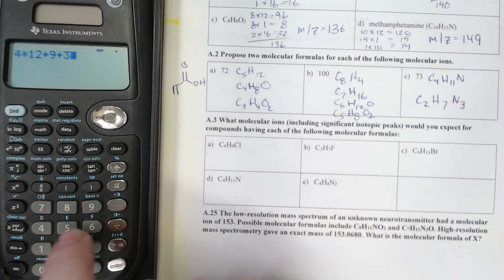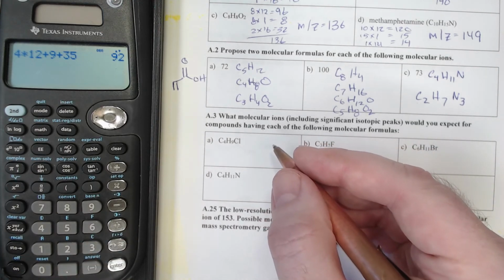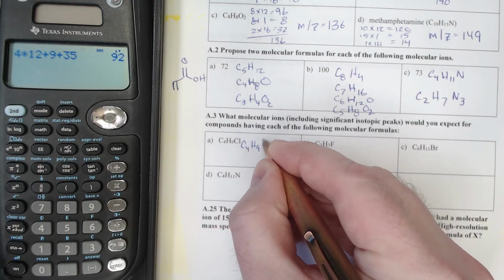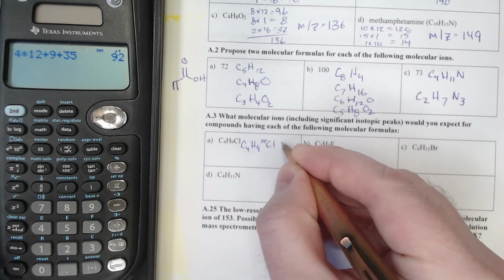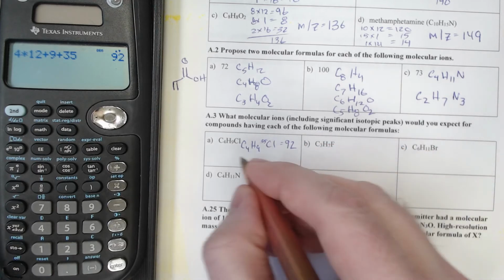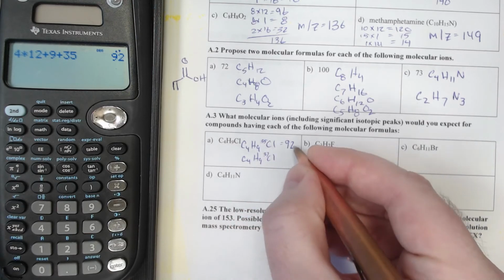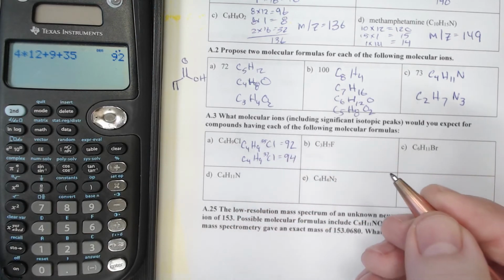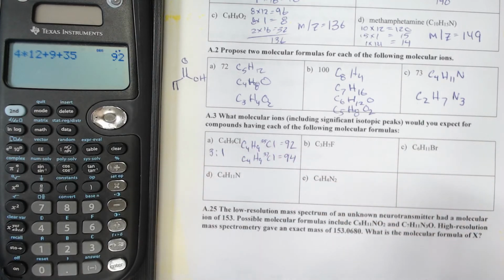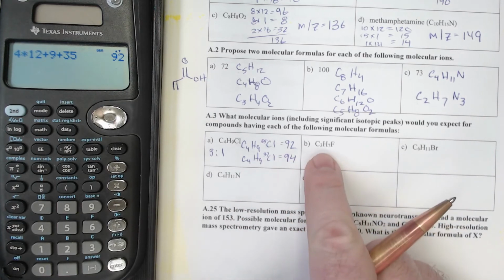And that's going to give us a molecular ion of 92. So C4H9 35Cl is going to have an m/z equal to 92. And if it were C4H9 37Cl, it's going to be 2 bigger. So you'll have one at 94, and you should expect this to be in a 3-to-1 ratio. That's what the peak pattern would look like for that.